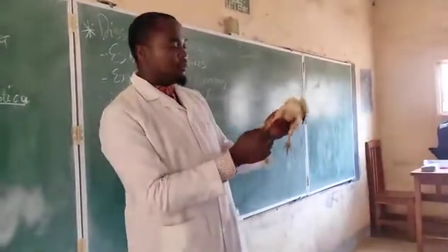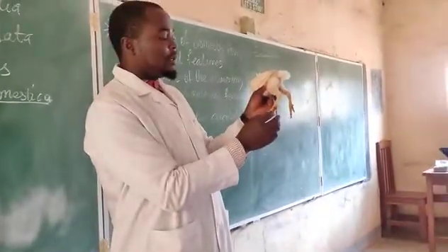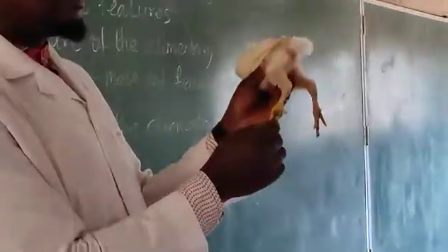Now when you look at the hind limbs, you see that they end with claws. Each bird has 4 claws, and they have what we call the 3+1 arrangement. We have 3 digits going in front and 1 behind, so that it can use them to grip the branches on which it's landing. The hind limbs are also covered with scales.